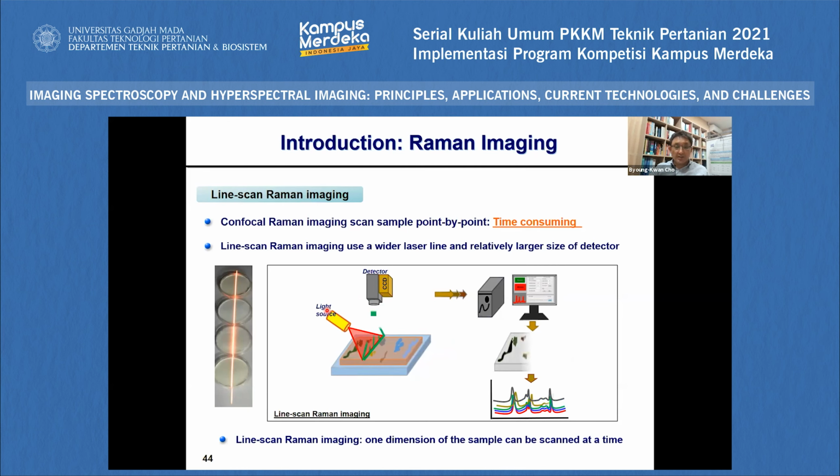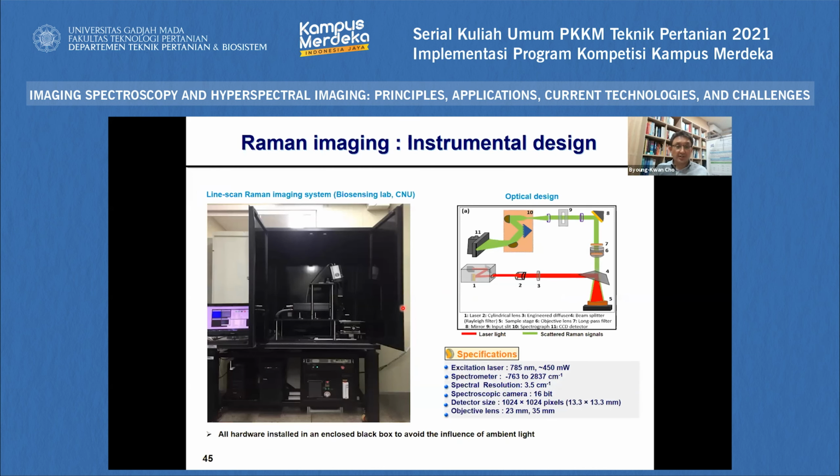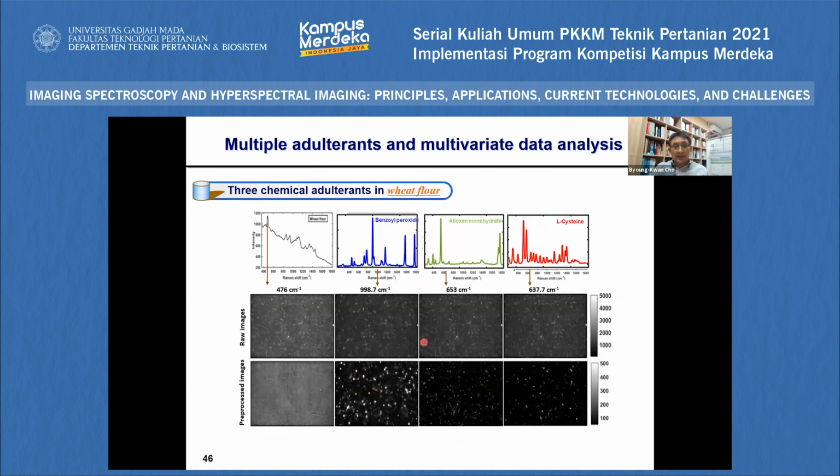The laser illuminates, and then the Raman signal is detected using a camera this way. This is the Raman hyperspectral imaging system we constructed, and this is an application.